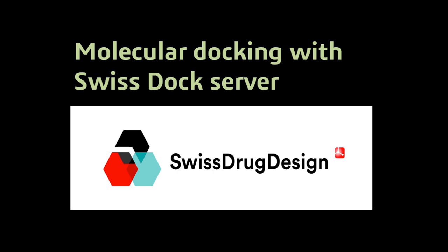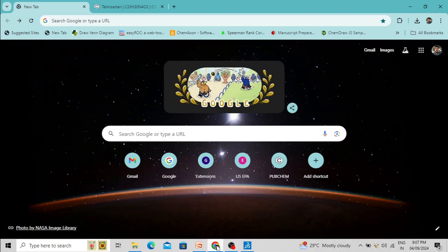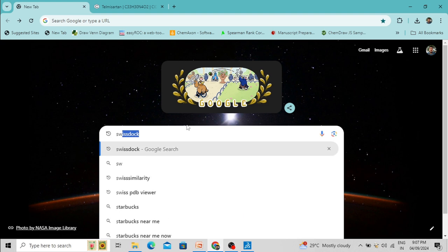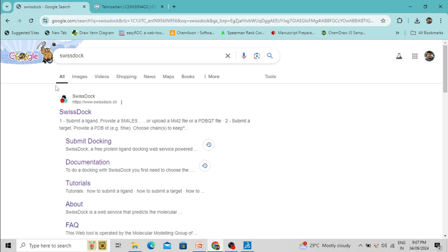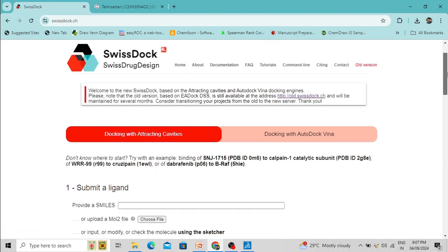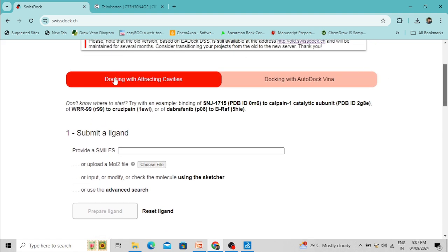For molecular docking using the SwissDock web server, you have to go to their website. First, type in Google 'SwissDock' and click on the link to open the SwissDock server. This is the server interface — you can see several options are available here.